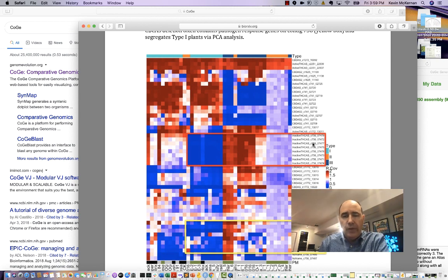Okay, so this is a case where these sets of genes, this is a gene on contigs, it looks at contig 756 right there, C756. This is the cannabichromene cluster. It's labeled as inactive THC synthase because that's what NCBI first learned of this as. It was submitted as an inactive THC synthase, meaning it makes very little or no THC synthase, but it might make some. And that's something to keep your eye on. It's now been cloned, and it's known to be the cannabichromene synthase cluster.